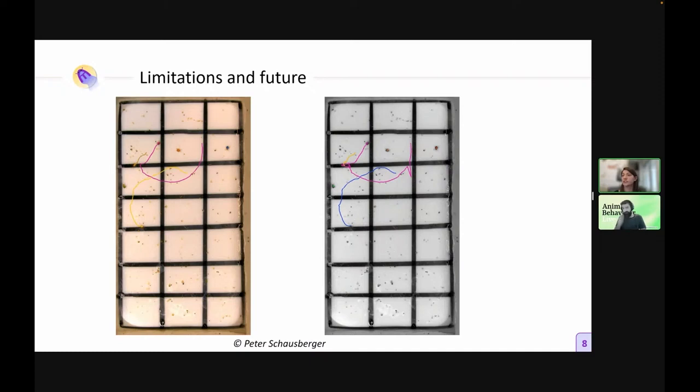I know that, for instance, in that mite experiment over the 5 minutes of the whole video that Peter gave me, it never happened. But I know that in others, I tried it with fish, and over a 1 minute video, I had, I think it was 14 identity swaps. But if you had the same video with a different resolution, you would have different results. And if you have the same video with another species of fish, you would have different results. So it's not really possible.